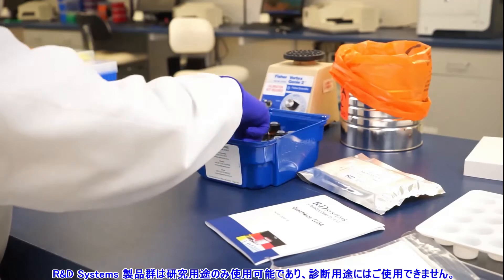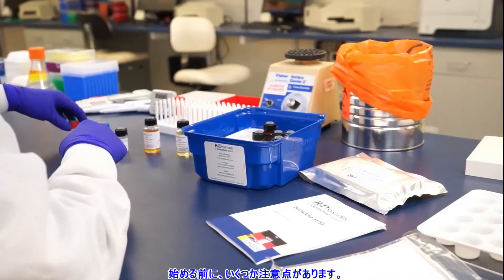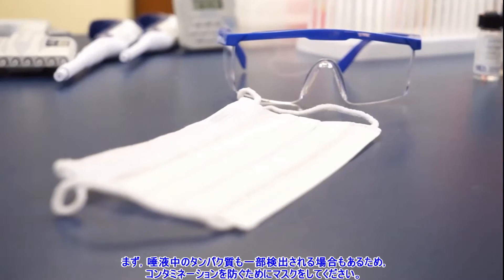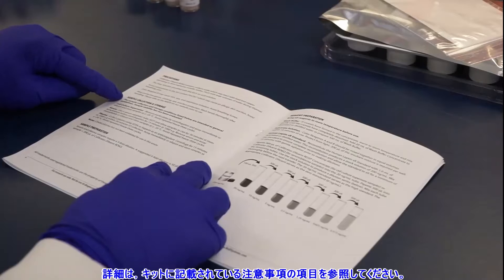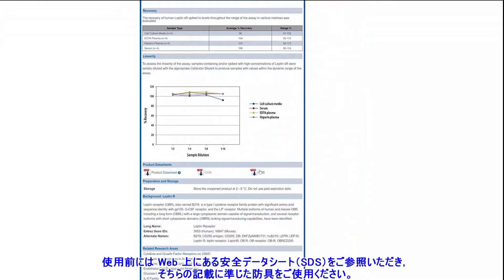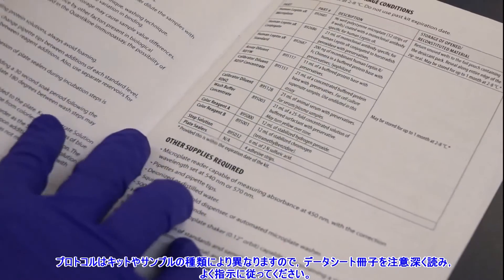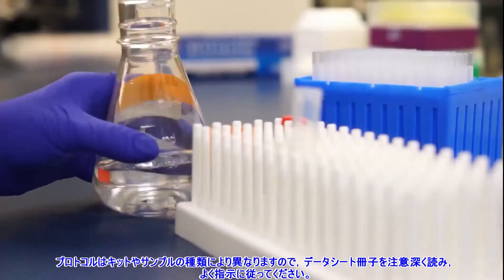This kit is for research use only and not for use in diagnostic procedures. There are a few important things to keep in mind before we begin. First, some proteins are detectable in saliva, so it may be important to wear a face mask to prevent contamination. Refer to the precautions section in your kit booklet for specifics. Also, be sure to wear personal protective equipment and refer to the safety data sheet on our website prior to use. Finally, protocols vary by kit and sample, so read your kit booklet carefully before you begin and during each step for specific instructions.